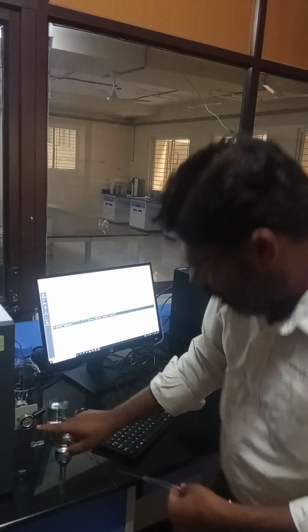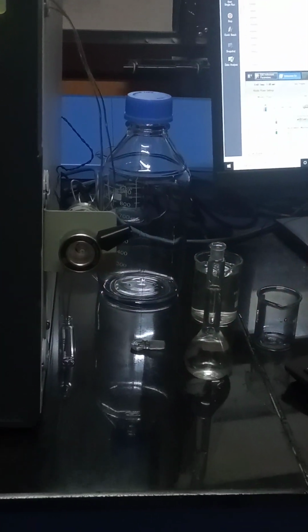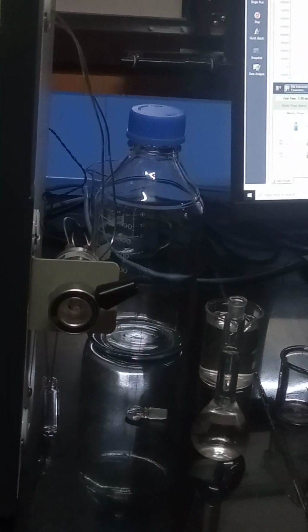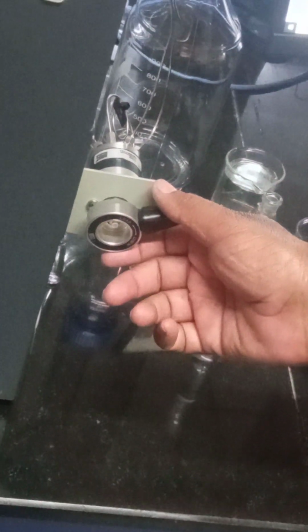After the message, this is the load position and inject position. Always by default the load position is there. Now in load position, inject the sample. It looks normal, just push it. The sample goes into the loop. Then switch to the injection position. Nothing will happen because the first time I am doubtful, so I take more quantity, but it will take only 20 microliter. That is important.